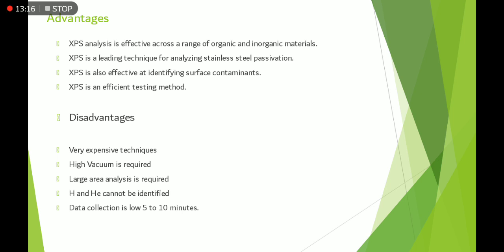Disadvantages. It is a very expensive technique. High vacuum is required for this technique. A large area is required. Hydrogen and helium cannot be identified. Data collection takes 5 to 10 minutes, which is very slow.